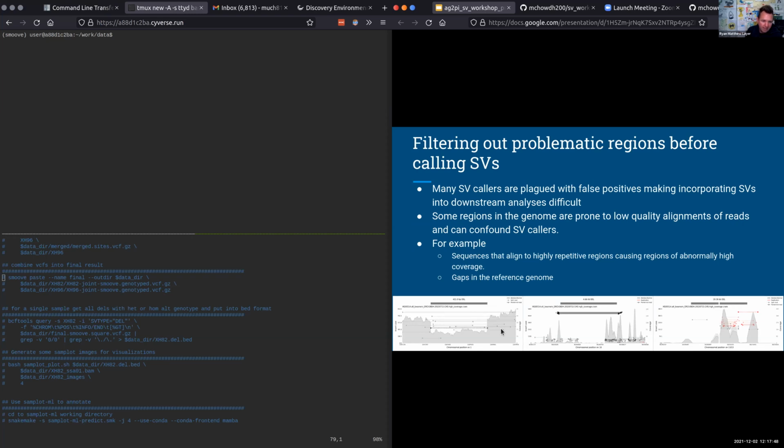And so this is a point that we've spent a lot of time trying to figure out, and it is critical for getting to a reasonable set of structural variants from which you can do things like population analysis or other standard variant analyses. I just wanted to make the point that this is a very, very important step, and it is unique to genomes that might have many gaps or have many contigs or don't have the same resources associated with them as model organisms have.